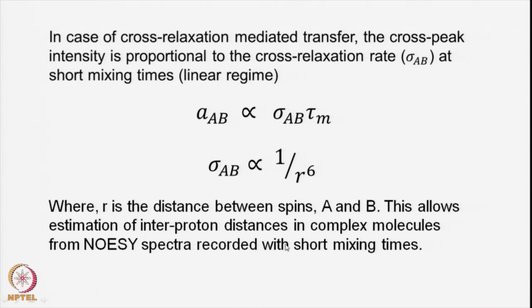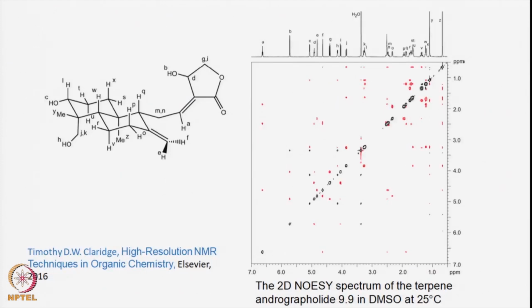So, this is a very important observation, and it has found extreme value in the majority of applications. In fact, a larger amount of biological NMR is now based on this kind of concept. Structural determination of large molecules has become possible because of this kind of strategy.